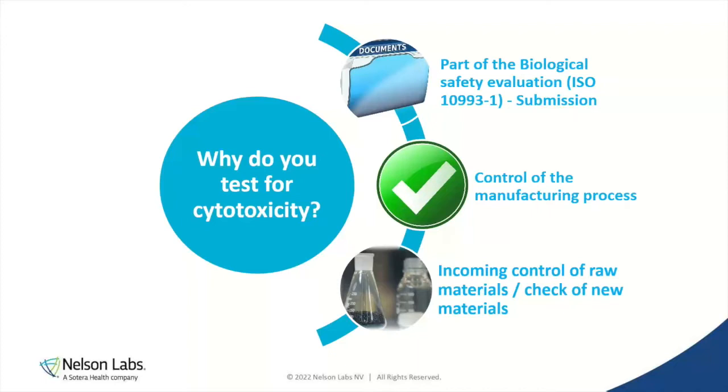Every medical device has to have a cytotoxicity evaluation. It's one endpoint you need to evaluate, mostly through testing. It's a quick test, it's cheap, it's easy to do, it's in the lab, so there is no reason not to do it. Some of our customers also use it as a kind of QC control testing of their manufacturing process to make sure that everything is still under control.